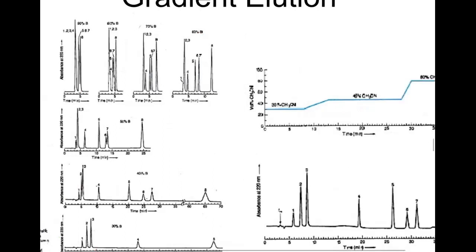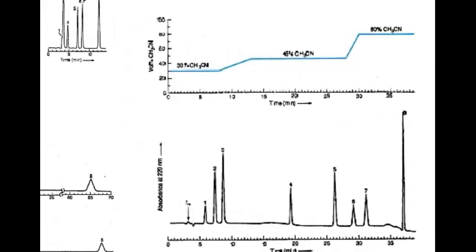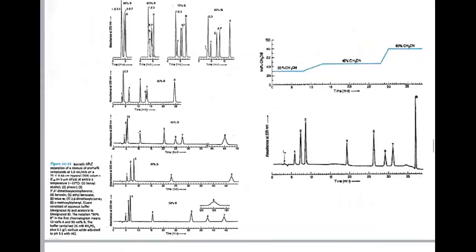But if you are able to change the composition during the run, you could start at a low concentration of the acetonitrile, the strong eluent, the strong solvent, things that dissolve things really well. Start at a low concentration of that until you start seeing some of the early peaks elute resolved. Kind of tease out differences in solubility basically between substances 1 to 3. Then you've got to speed things up, so just ramp the composition of your stronger solvent up. Doing so will allow you to elute these later compounds much more rapidly. You can see we've achieved everything here in less than 40 minutes. This is gradient elution. It maintains resolution in early peaks while speeding up those late eluting peaks, okay?